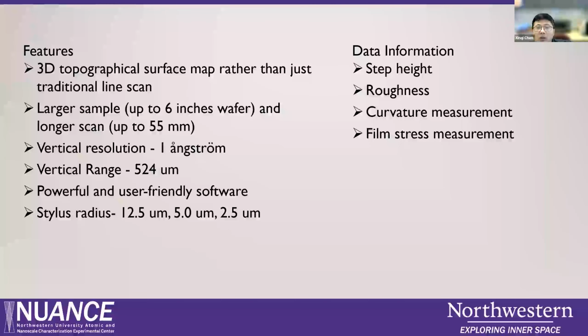So what information can you get? Besides step height and roughness, for this stylus profilometer we can also get curvature measurement. If you have a whole wafer, you can get a curvature measurement. And also, if you do a coating of film, you can do the film stress measurement. Okay, next slide.